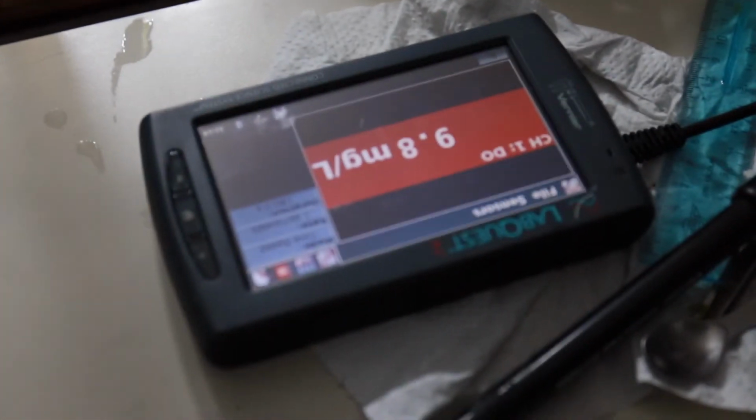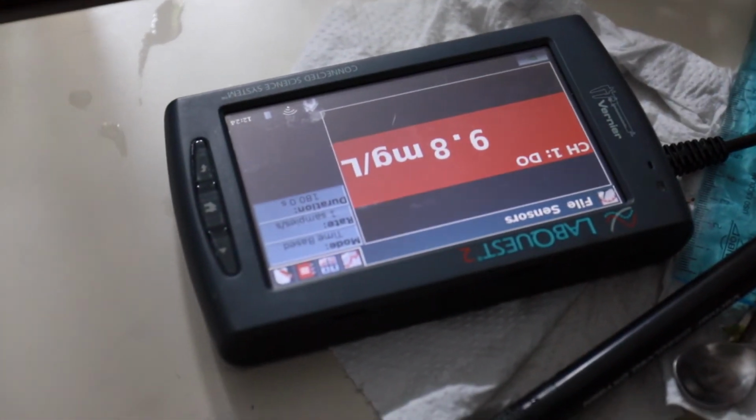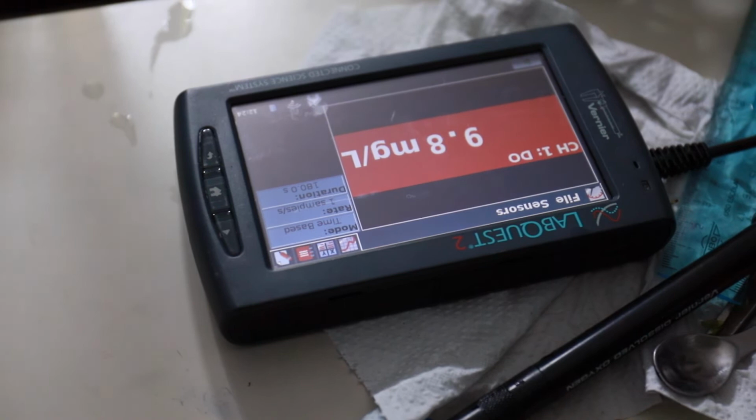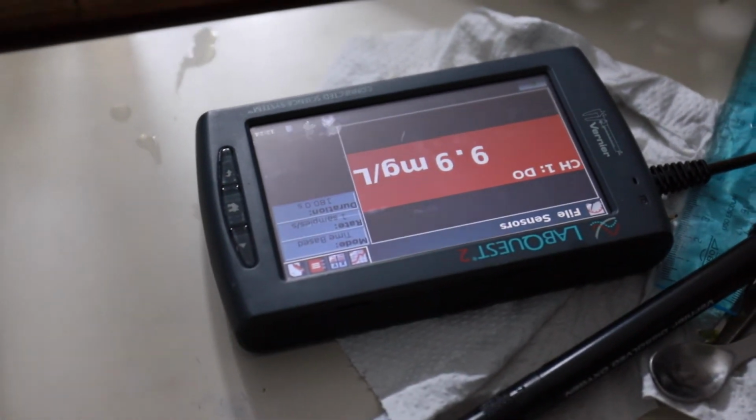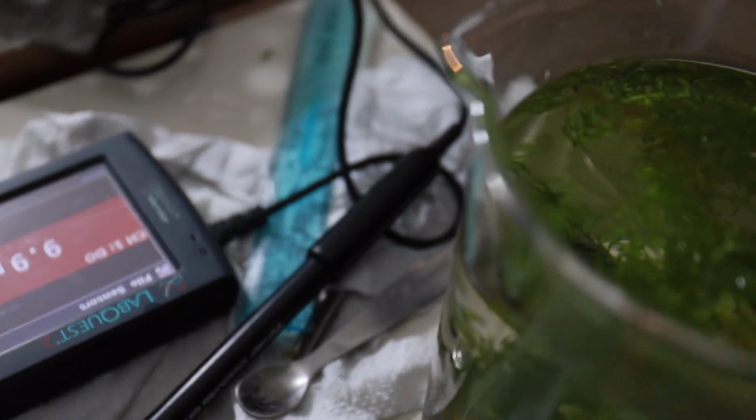But then today I'm going a different path, and I'm using this oximeter, which basically measures the concentration of oxygen in water. So I'm using a different plant, an aquatic plant. And I'm measuring it at different light intensity.